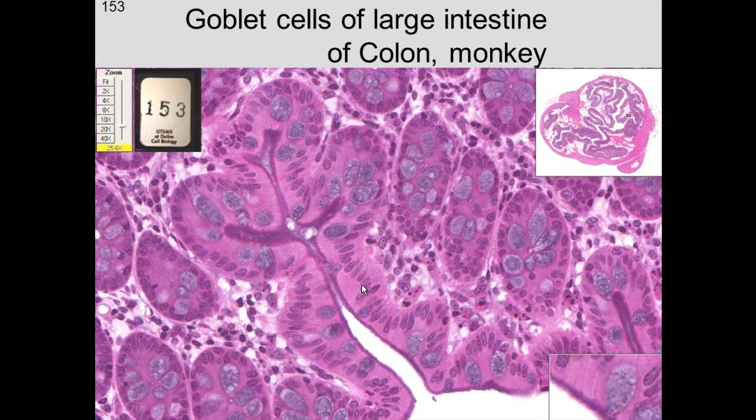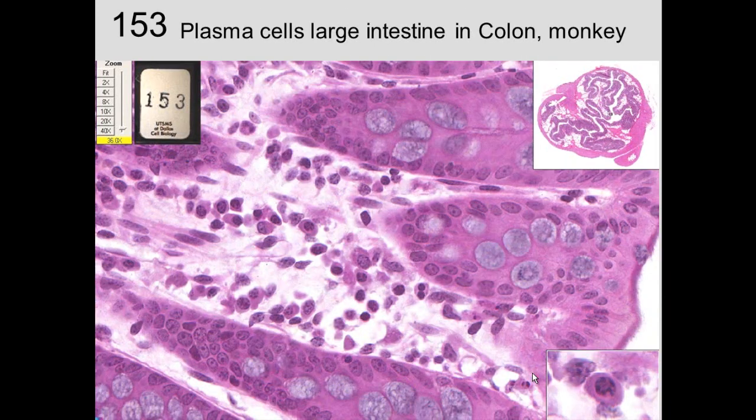This is one intestinal absorptive cell right there, columnar shape, more cytoplasm above the nucleus and between nuclei. And then these guys are goblet cells, some of which you might be able to see discharge their contents like this one. So here we see the intestinal absorptive cell, brush border on the surface. Right in here we can see the terminal bars. The terminal bars are where adjacent cells are attached together with junctions.